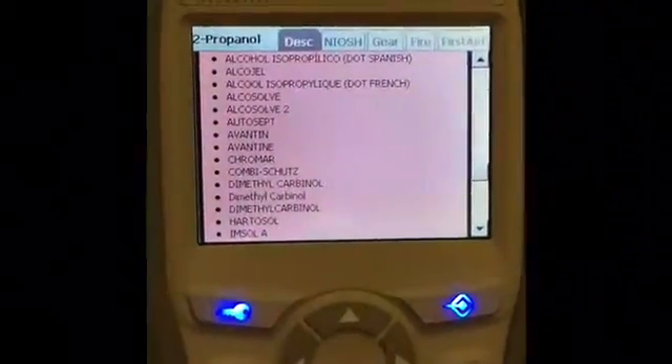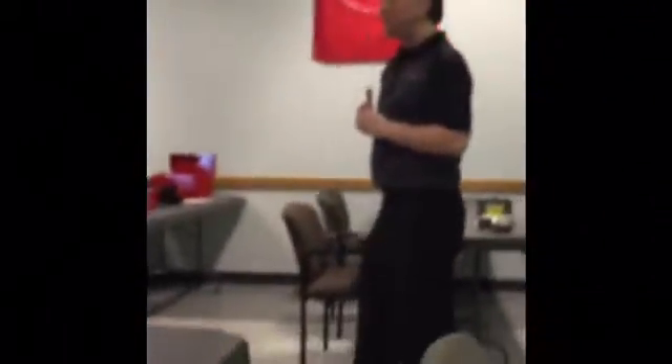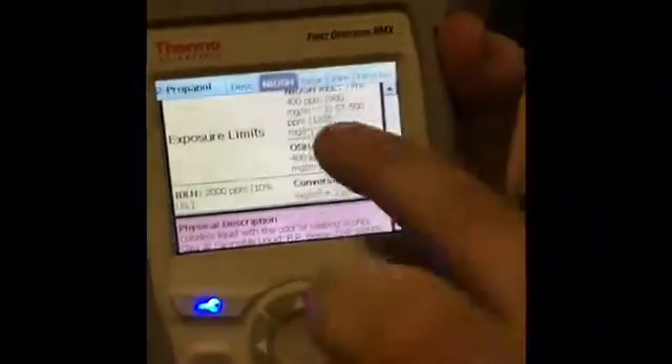The first one is a spray insecticide with all the different names — interesting. It's probably too complex a mixture; there's probably a lot of stuff in that. If it's not in the library, sometimes it may get the active ingredient if the signal is really strong. It's too complex a mixture with a bunch of industrial chemicals and exposure limits right in there. We can try it with FTIR but I doubt it will get that as well.